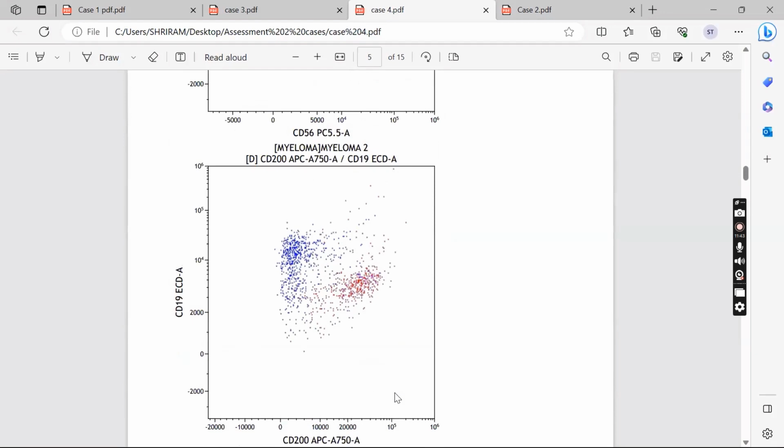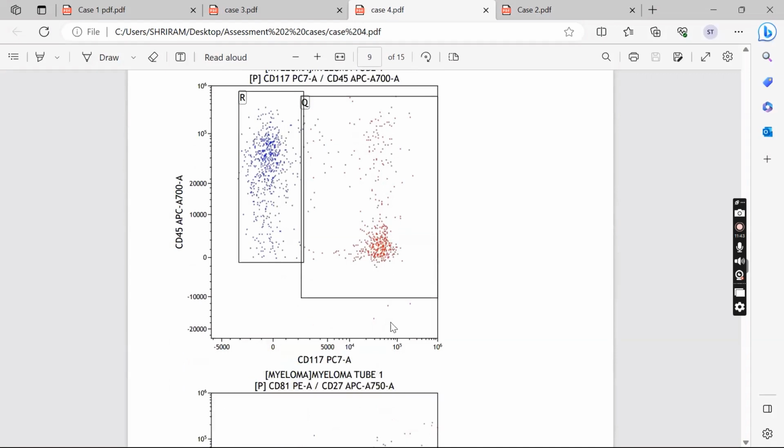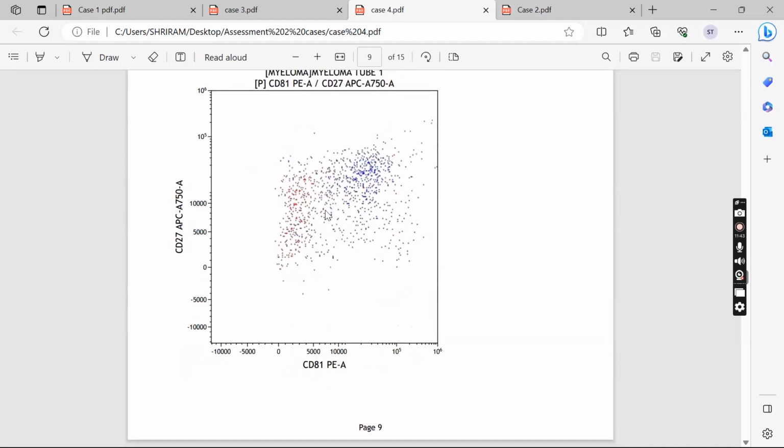but it can be downregulated by time. With increasing time or with delay in sample processing, CD138 may go down. So my initial gate will be side scatter versus CD38, where I draw a very broad gate, including all the populations, including some amount of hematogones, monocytes, etc. Then I purify this particular population with 38 and 138. So any population which is 38 positive and 138 positive or dim, even if 138 is falling in this region, I'll include that into the gate.